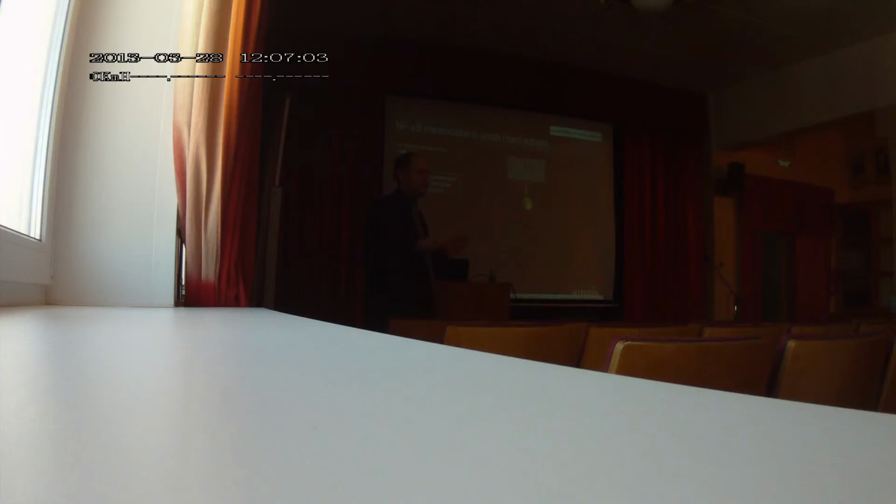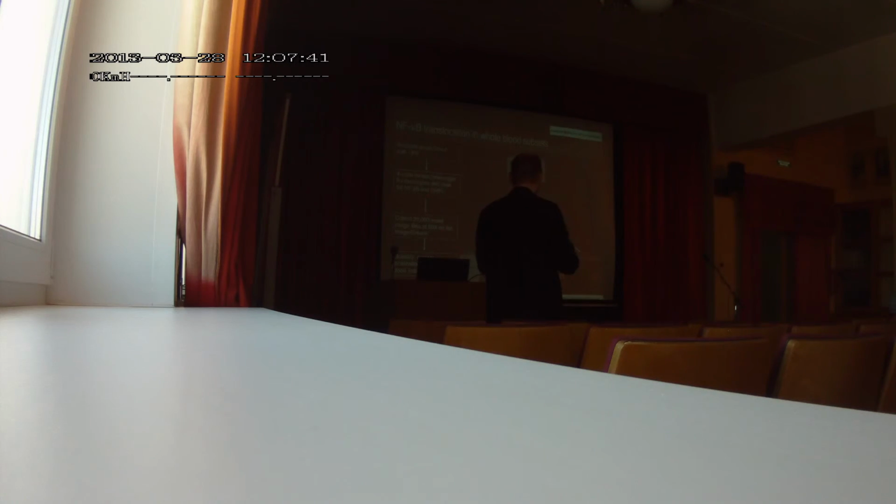The first step to identify the different white blood cell types was immunophenotyping. Each white blood cell type of interest, in this case neutrophils, monocytes, and T cells from the lymphocytes, was immunophenotypically stained. We have four-color immunophenotyping, and staining was also done for nuclear factor kappa B and for all the nuclei. 20,000 cells were collected at 60x magnification on the ImageStream, and they were trying to quantify the nuclear localization in the whole blood in those different types.